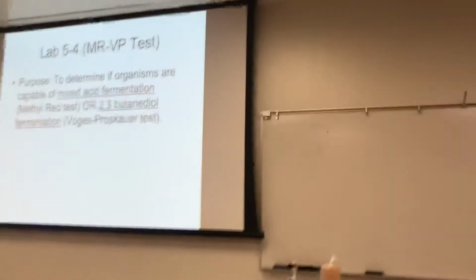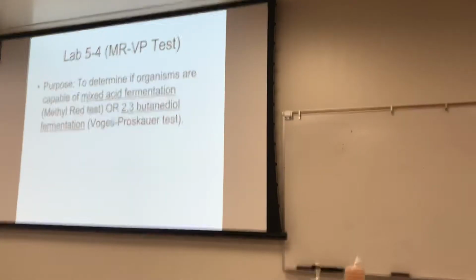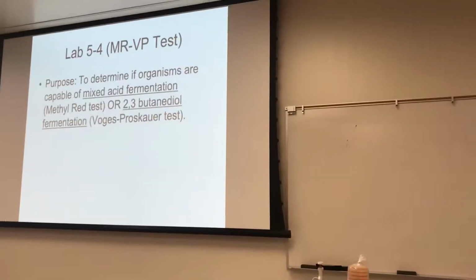Another way of looking at fermentation again, the only difference is we're finally going to look for alcohol. So we've never done that in any of the labs. We've never looked for alcohol.